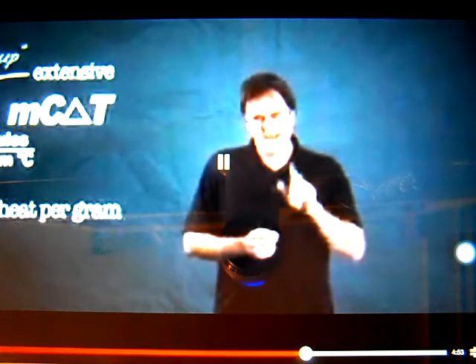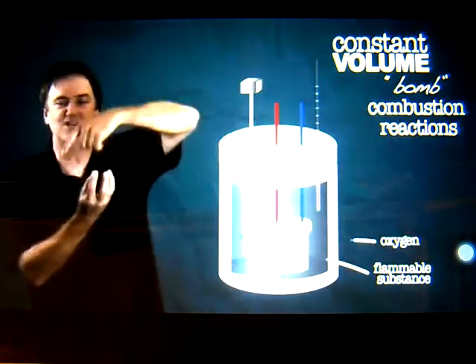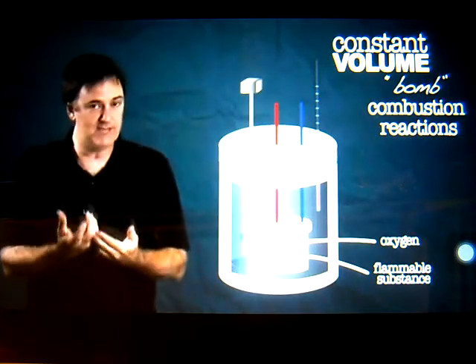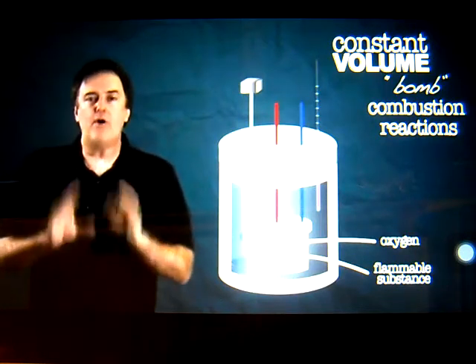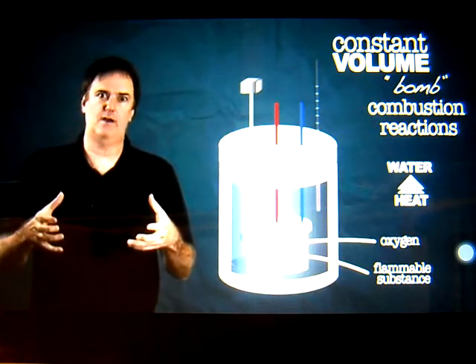Now, for us, we don't want it to explode, so we make sure we don't use enough material to blow the thing to bits. But we do use enough to make it get really hot inside, but the volume is set. So because the volume can't change, there's no work done, which means all the energy is dissipated as heat into the surrounding water.